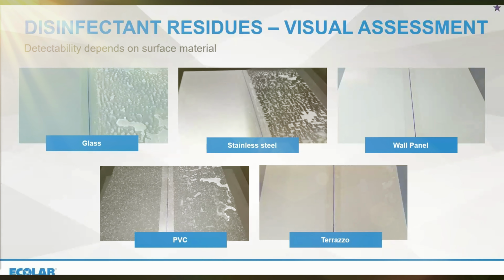And the object of this slide we've presented here is we've got a variety of different surfaces, and each one of those has got a disinfectant residue on it. And unfortunately, our main way to assess residues remains visual. There is work underway to develop more sophisticated tests based around conductivity. But for the standard cleanroom operation, and from the point of view of the person undertaking the cleaning or disinfection, then it's the visual assessment which is the key thing.